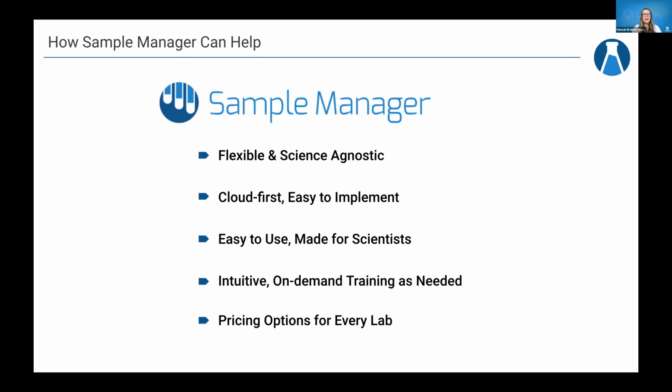We also provide lots of mechanisms to quickly get samples migrated with our standard template, which again, people have used coming from other tools or coming from Excel or curating on their own. And you can also use those existing spreadsheet formats to create the data structures themselves. So not only import, but have us take a guess at what those structures should look like.